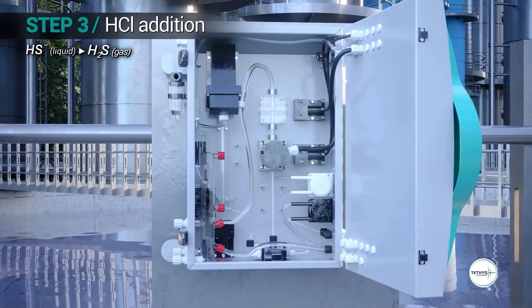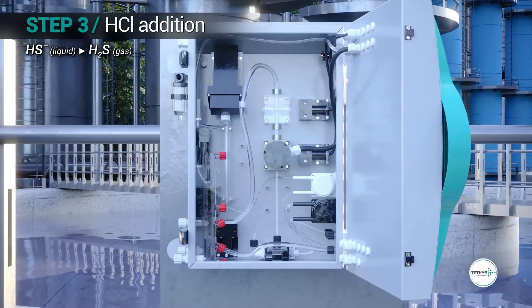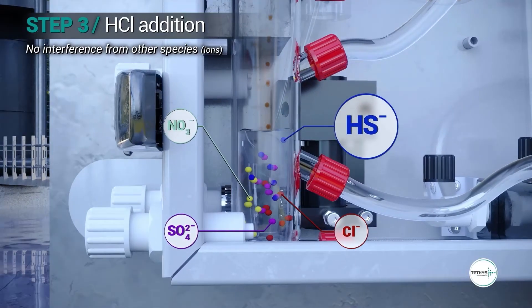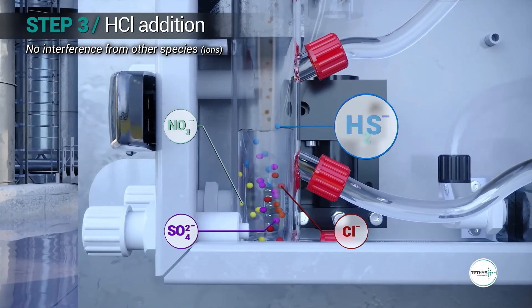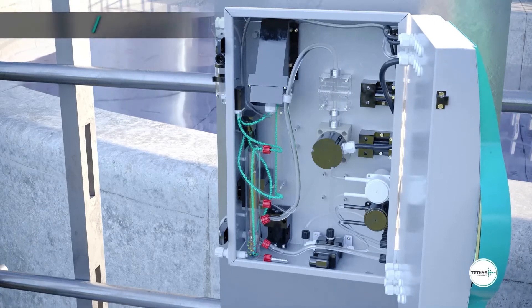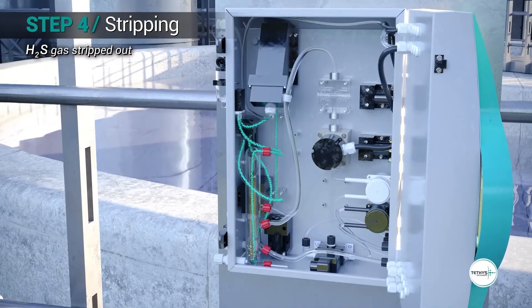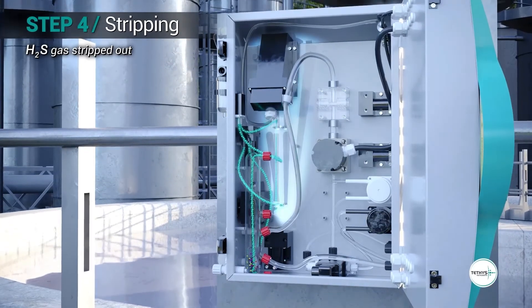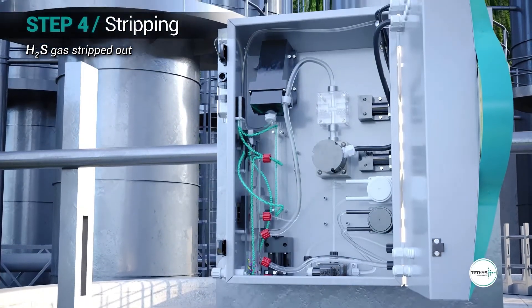Hydrochloric acid is added into the sample to decrease the pH below 5. In this condition, the bisulfide ions in the water sample are converted to hydrogen sulfide gas. The hydrogen sulfide gas is stripped out from the water sample and carried to the gas flow cell to acquire its UV absorbance spectrum.